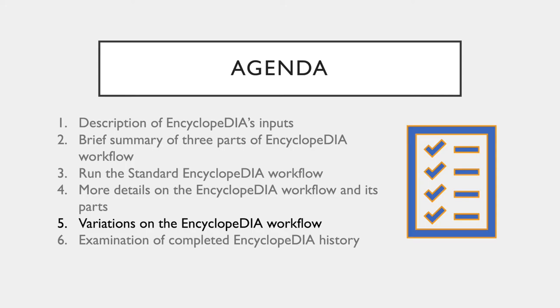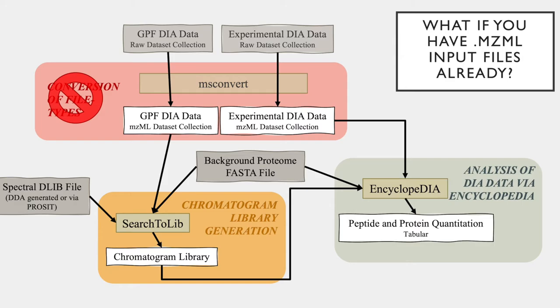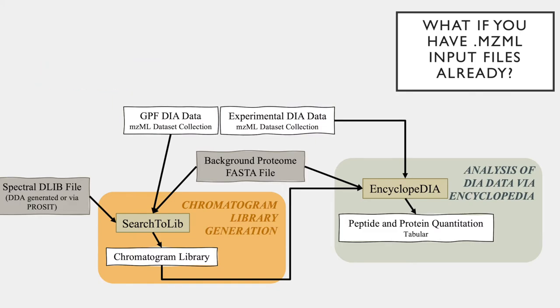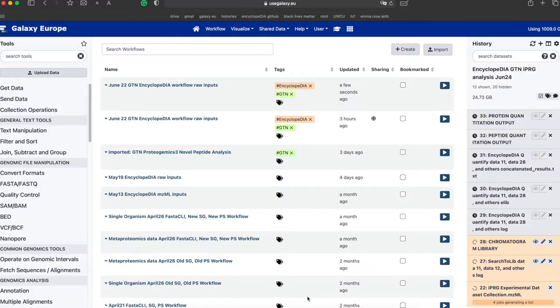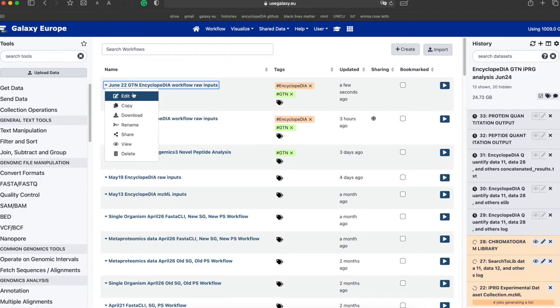Now we will discuss how the Encyclopedia workflow can be tailored to your specific DIA data by altering the parameters of the workflow, as well as variations of the workflow that are available. If you converted your experimental and GPF files to the mzml format outside of Galaxy EU, you can alter the standard workflow to directly use your mzml inputs. Simply, you take out the msconvert step. To edit the workflow to accept mzml inputs, go to the Workflows tab at the top. Go and make a copy of the Encyclopedia workflow using the raw inputs that was taken from the shared data workflows tab.